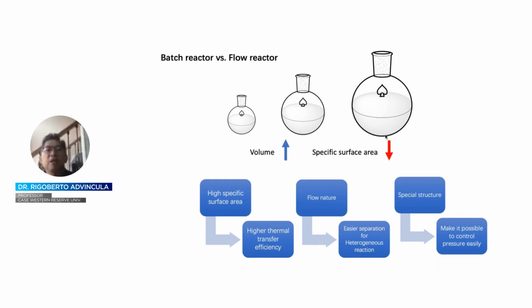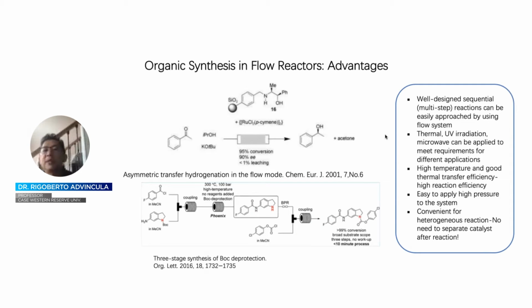Now, this is not entirely new. In fact, as materials chemists, we benefit from what has been done even in the pharmaceutical industry. So when organic chemists talk about the conditions on a flow reactor, they get all excited because they know the value of this. For example, in asymmetric synthesis, where one has to control the enantiomeric excess or the different types of enantiomers that one is able to obtain, for example, to synthesize a drug or a drug precursor.